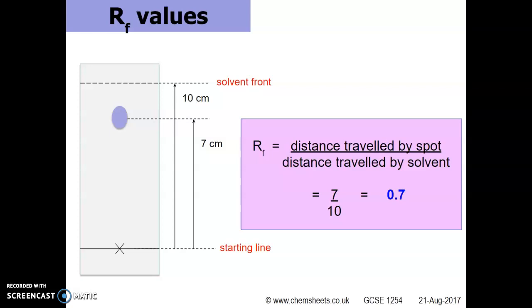Doing the same sort of comparing that you'd do, or that was done on those previous slides, they found it had this substance that was not a permitted colouring, and Asda, Iceland and places like these had to remove all of this chili powder and certain ready meals from their shelves.